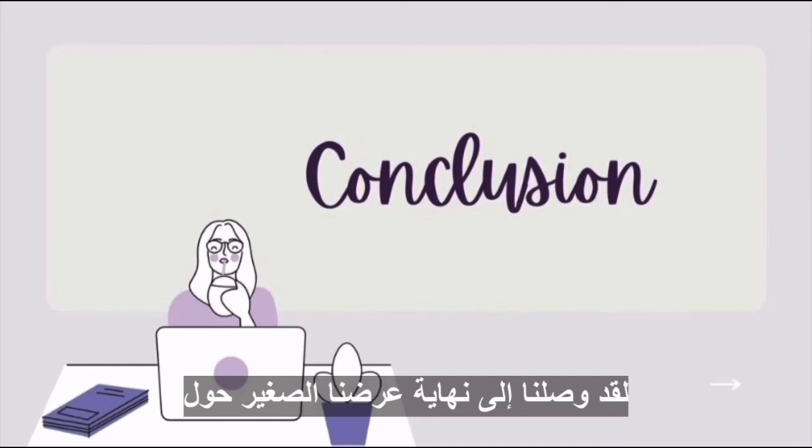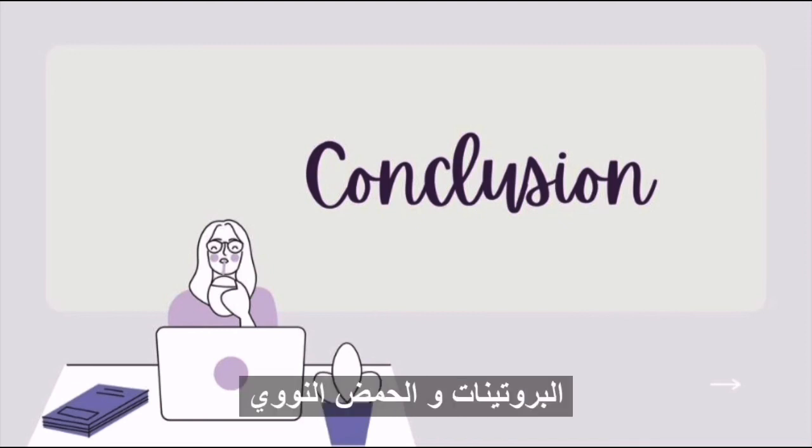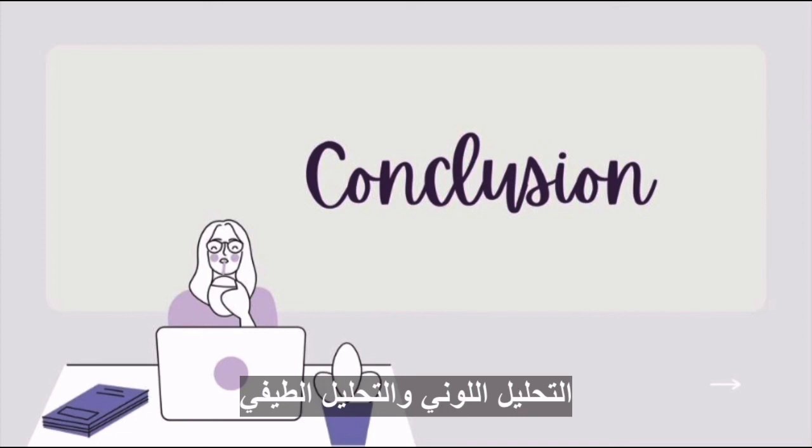We have reached the end of our small presentation about electrophoresis. So, in conclusion, electrophoresis is a key analytical technique for the separation and analysis of protein, DNA, carbohydrates, and other biomolecules. It is an essential prerequisite for many techniques that are used in molecular biology and, alongside chromatography and spectroscopy, is a fundamental procedure in the laboratory.